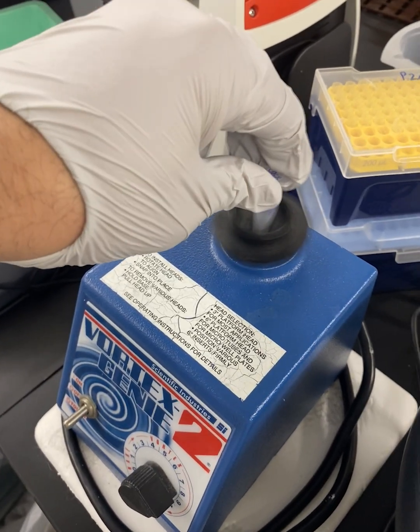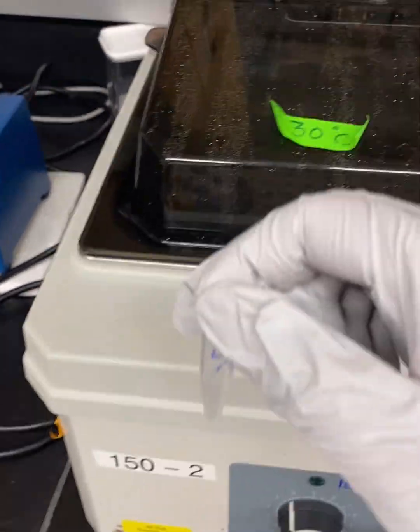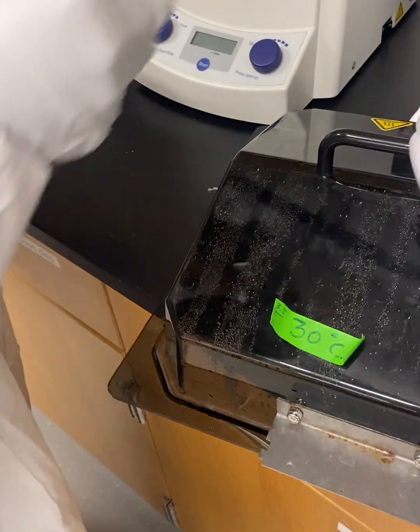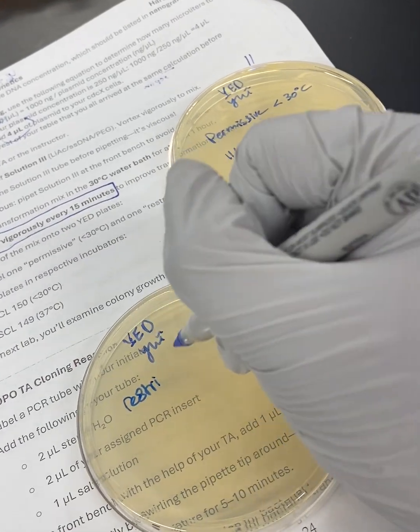This is where the long incubation happens. We incubate it for an hour, and during that hour we place the tube in the 30 degrees Celsius water bath and vortex it every 15 minutes to keep the DNA, PEG, and cells well mixed. This step dramatically boosts our transformation efficiency.